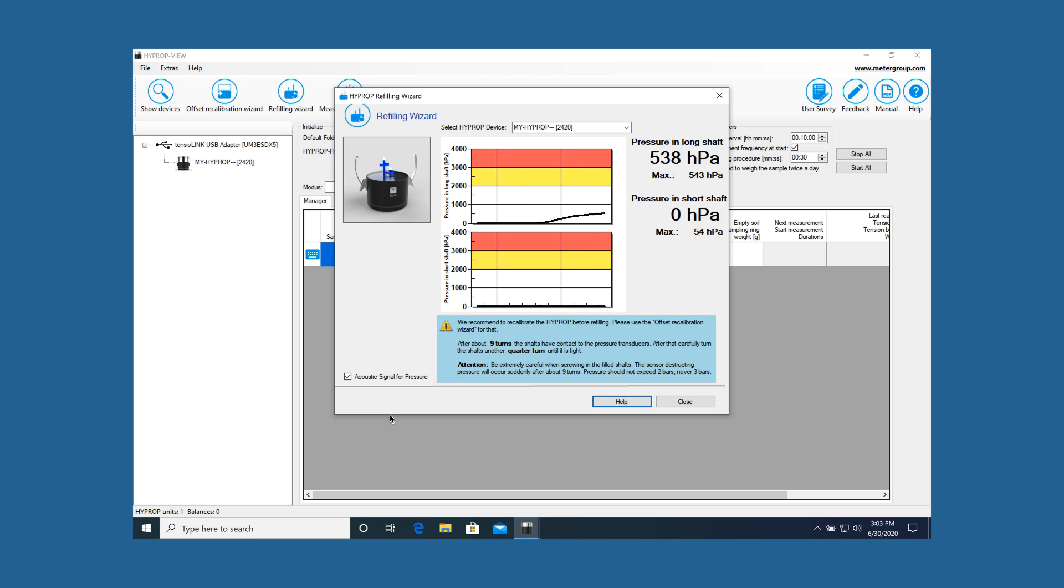If the pressure does not rise to tensions close to atmospheric air pressure, see the manual for troubleshooting. As the pressure has reached the atmospheric air pressure, for example 1000 hectopascals or 100 kilopascals, wet the ceramic immediately with deionized water.